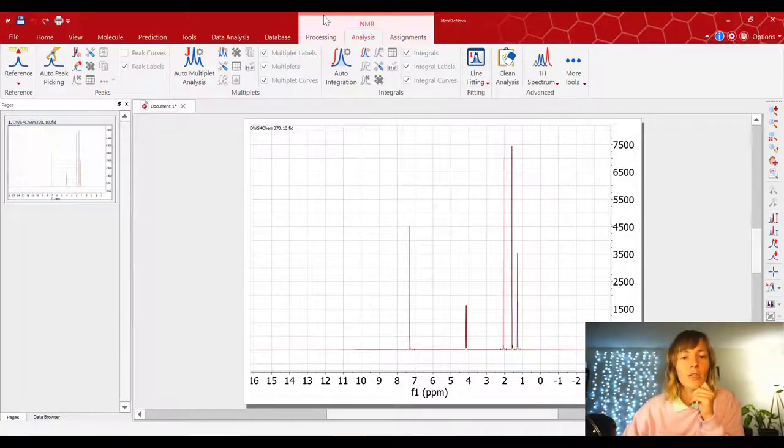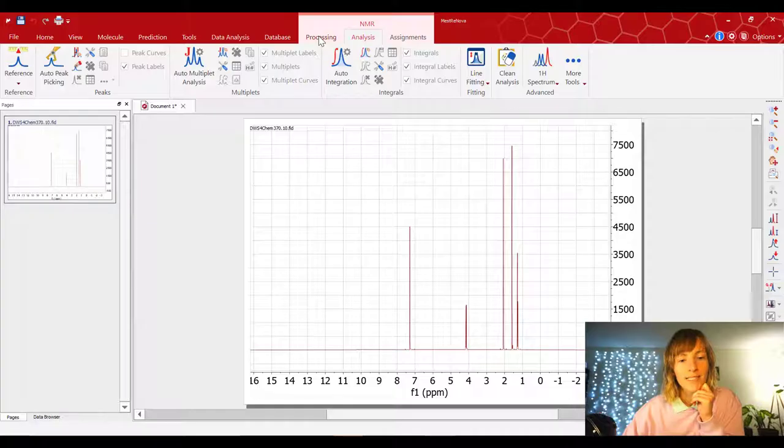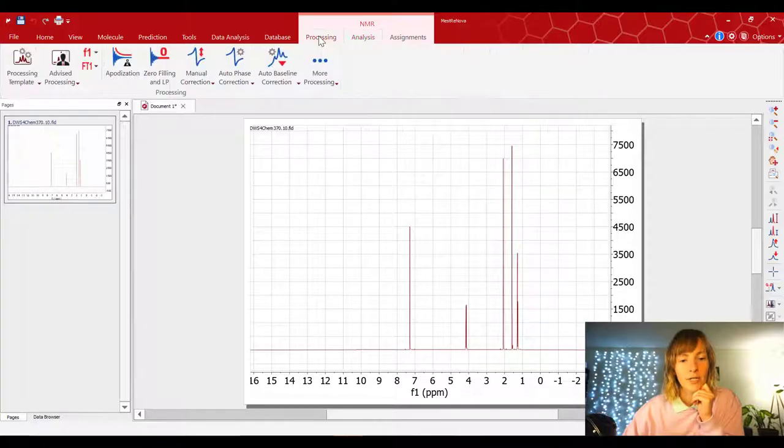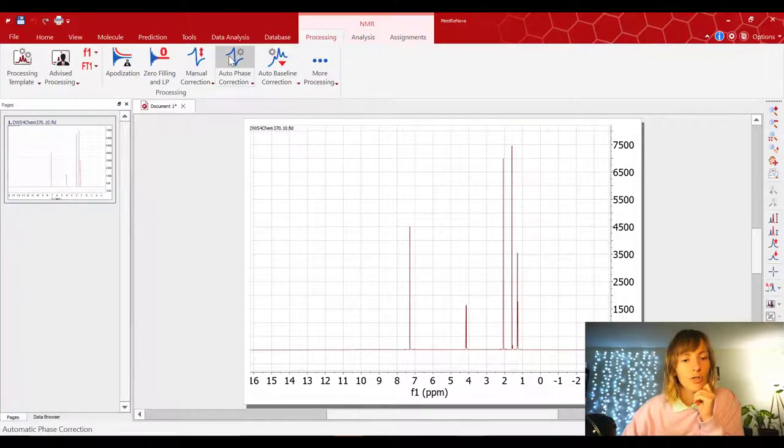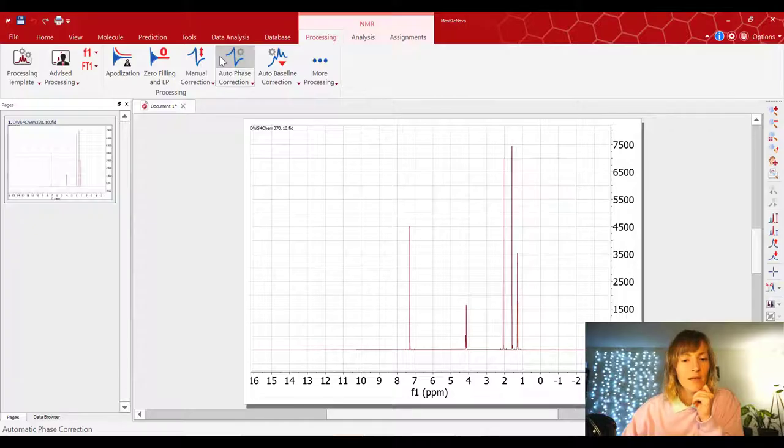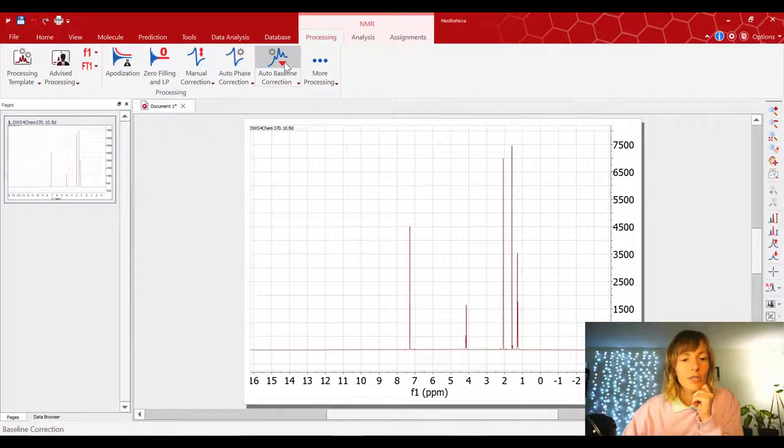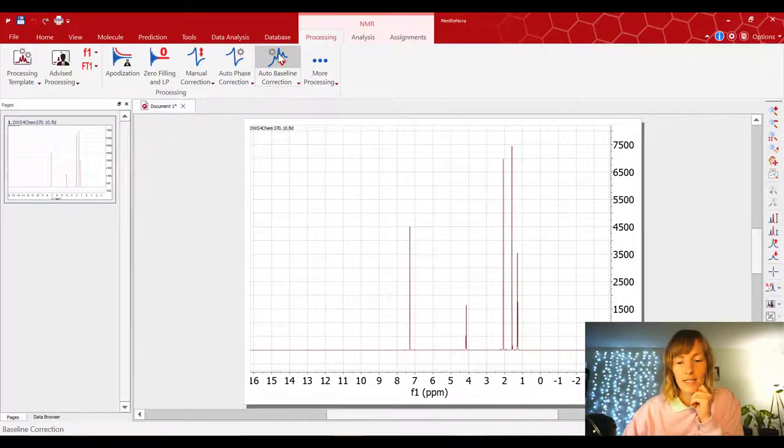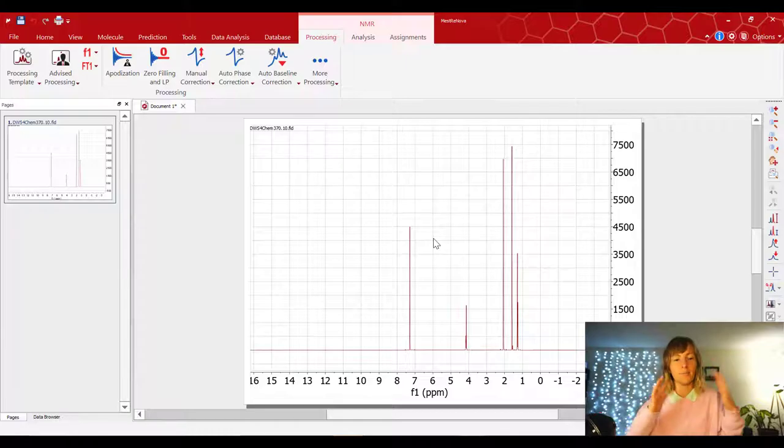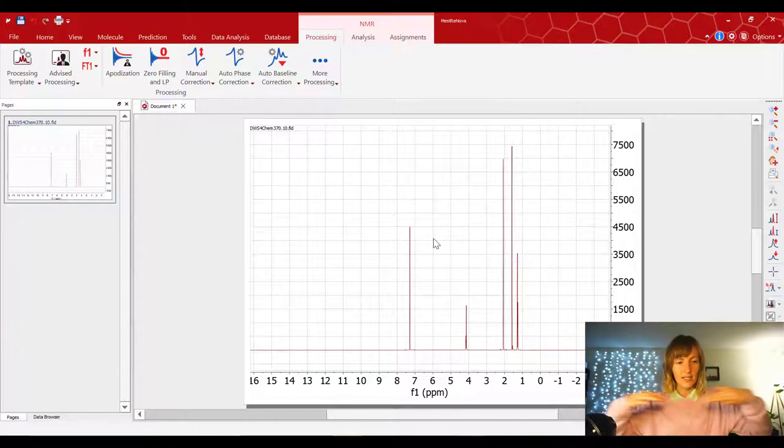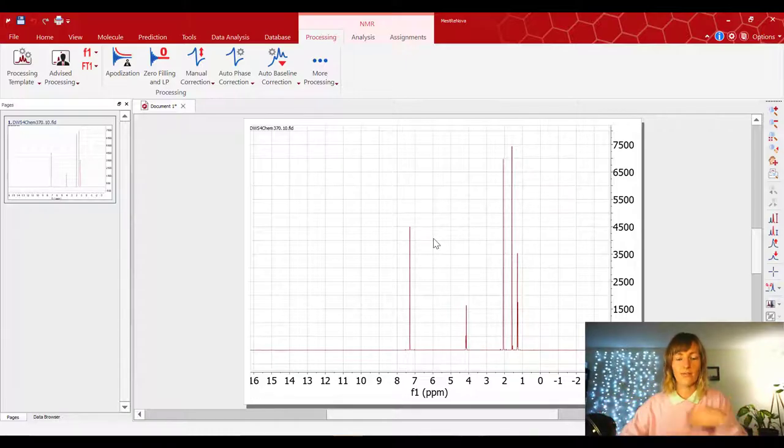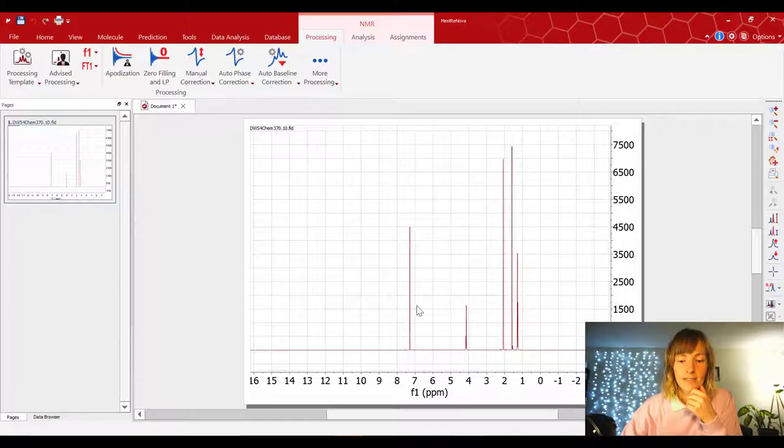So in your MNOVA software, navigate to this Processing tab under NMR. And the first thing you're gonna do is auto phase correction. And then you're gonna select auto baseline correction. So this kind of evens the peaks out a little bit and brings the baseline to a more flat line.